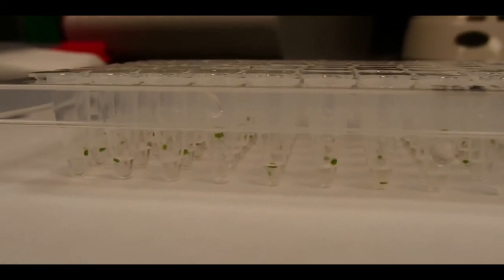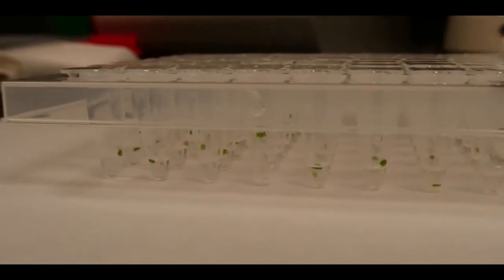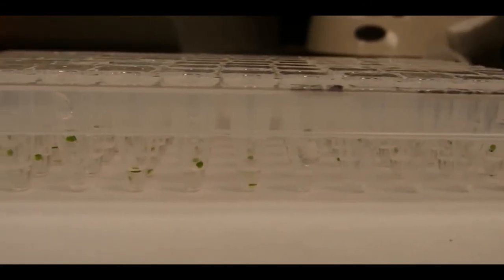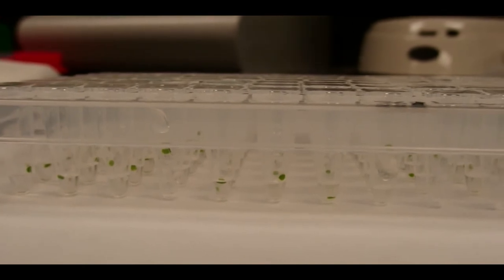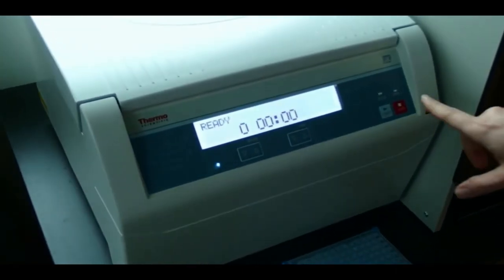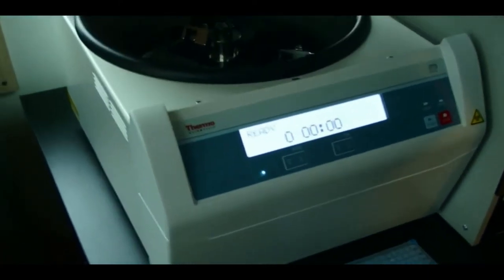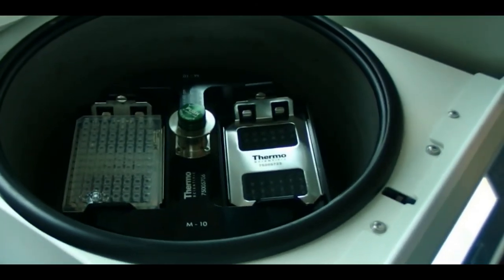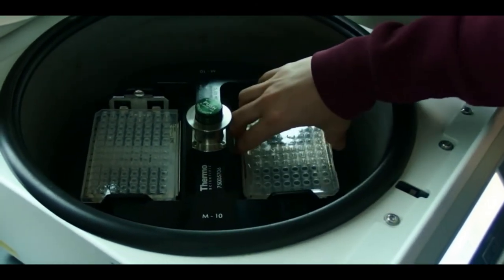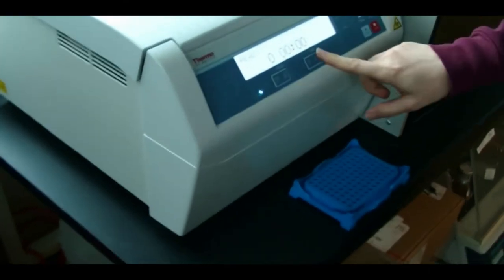After the PCR plate or the DNA extraction plate is finished, you'll notice that not all the discs are at the bottom of the wells, and not even all the solution is at the bottom of the wells. So now we'll spin this down in the centrifuge so everything is collected to the bottom. We'll come to our thermo centrifuge, and it has a plate rotor in it right here. Go ahead, Sarah, you can load that guy in there. And then of course we have to balance it. We don't need to spin for a very long time, so go ahead and close that, and press start.